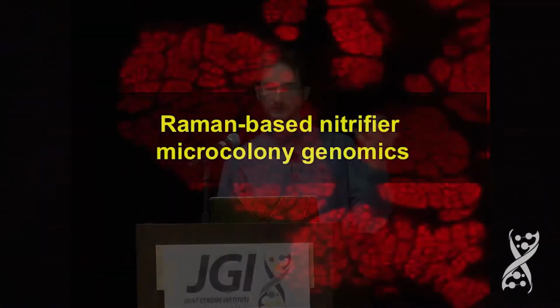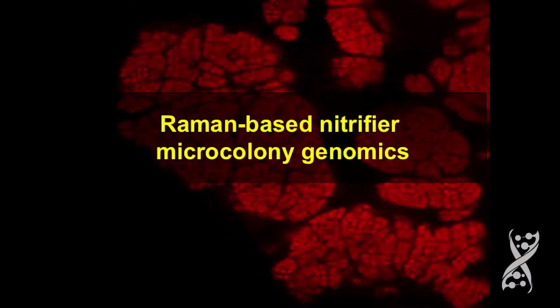Of course, parallel to this high-throughput automated sorting development project, we try to push the manual sorting to its limit in a real scientific question, which I will talk about in the next part of my talk. Our group is mainly working with nitrifying organisms, both archaea and bacteria, which can drive the oxidation of ammonia into nitrite and then nitrate. This field is moving forward very quickly, and there is still a lot to explore.